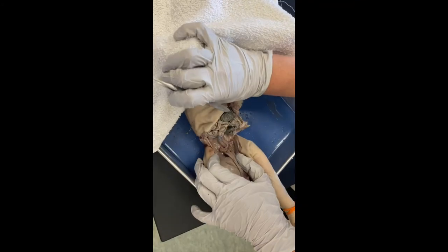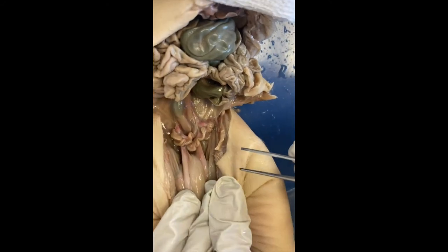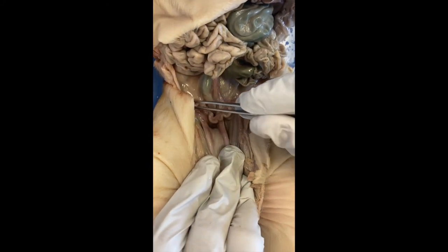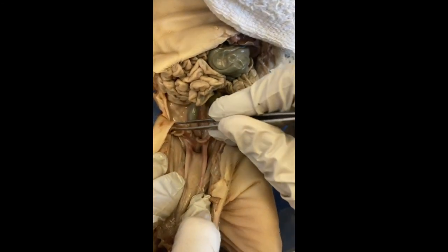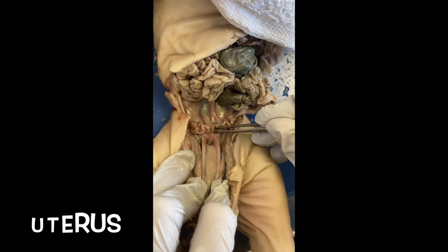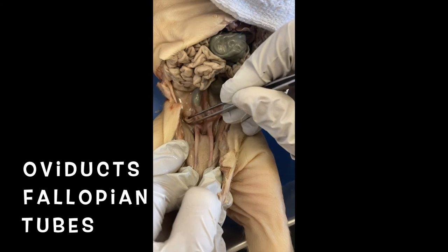Anatomy. So I opened up the female pig. And immediately you can see, you're probably like, oh my gosh, I see fallopian tubes. Yes, you do. So if I take the bladder and really pull back and go in with these tweezers, it kind of almost collapses down here into her bladder region. And if I pull them apart a little bit, it maybe looks more like what you think it would look like. So this area where a child or offspring would develop, this region here would be the uterus of the female. These cute little curly cues here, like fallopian tubes, are called oviducts.